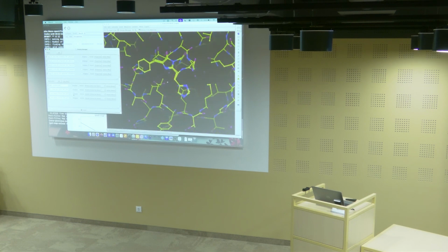Now, in this particular case, the conformational switch is so large that the automatic programs did not handle it properly. So I will have to intervene manually. Anyway, at this point is where the program stops and where you have to refine your structure yourself to get to your final structure.